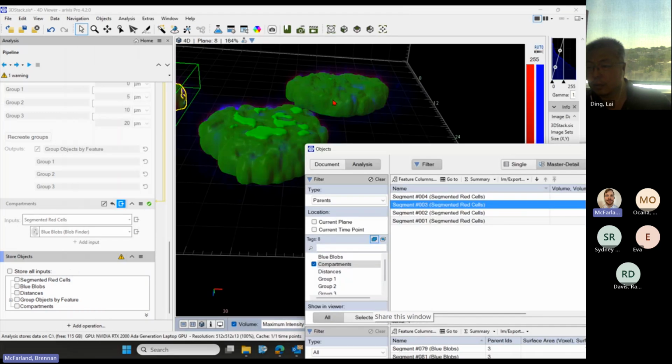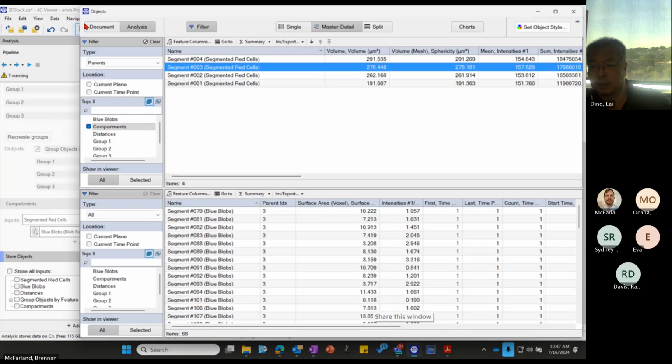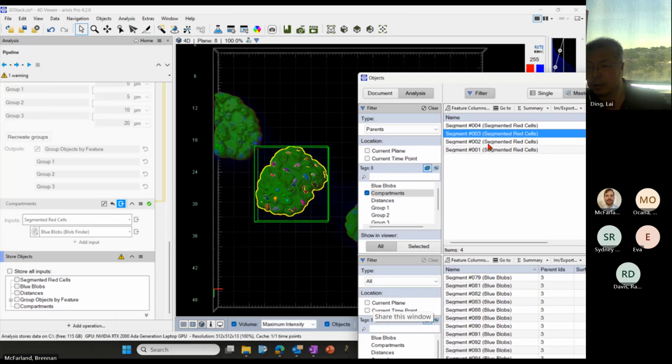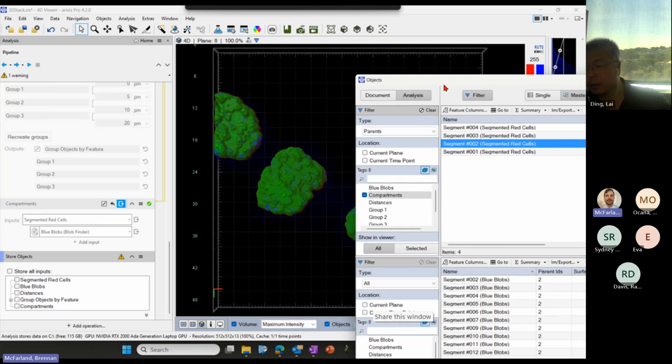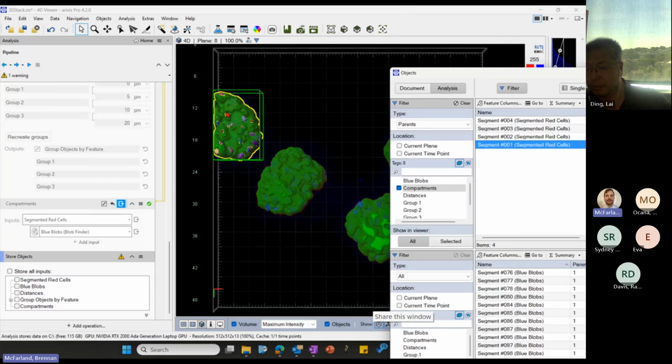Same thing with this here. There are 68 blobs that are within this object here. And this one up here, there are 73. And then this one over here probably is going to have the least, 52, probably because it's cutting off some of these on the border. Okay.